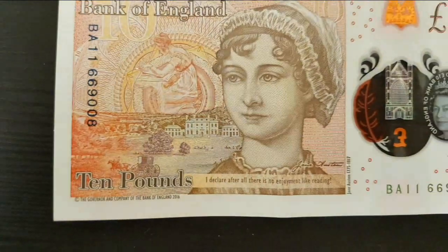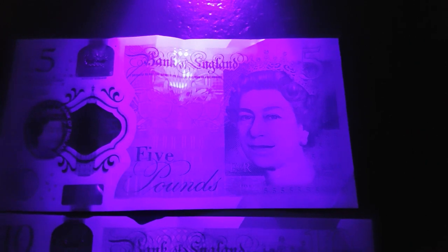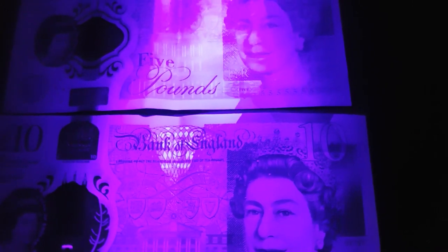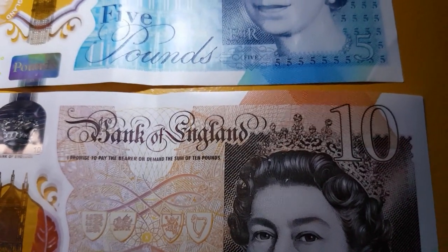Let's try the UV on the microscope — it does appear to be genuine UV as well. That 5 and 10 marking isn't visible under white light. Let me show you — it's dark in here. There we go: yeah, that 5 and 10 is not visible under the white light. Oh, that's impressive.